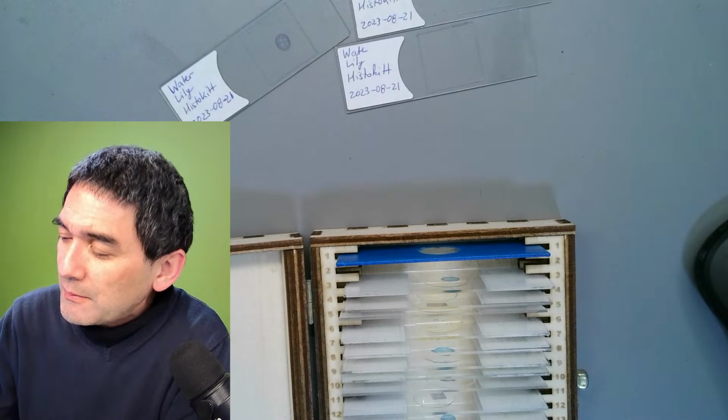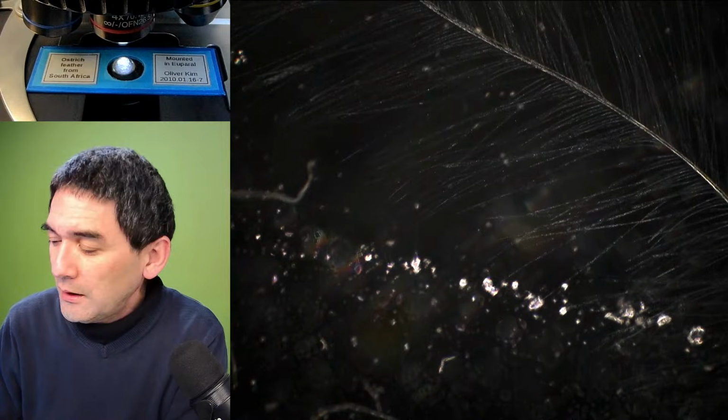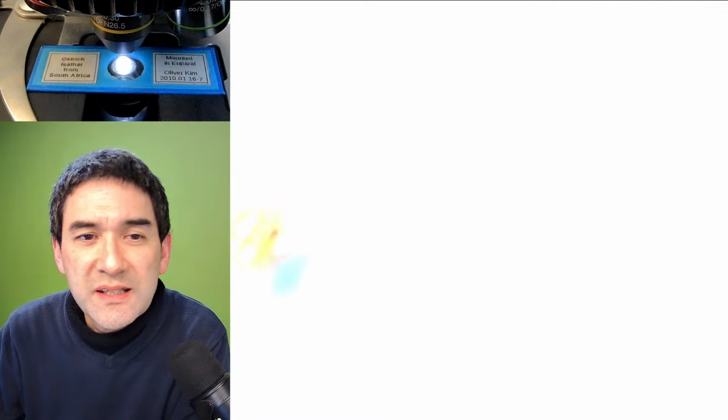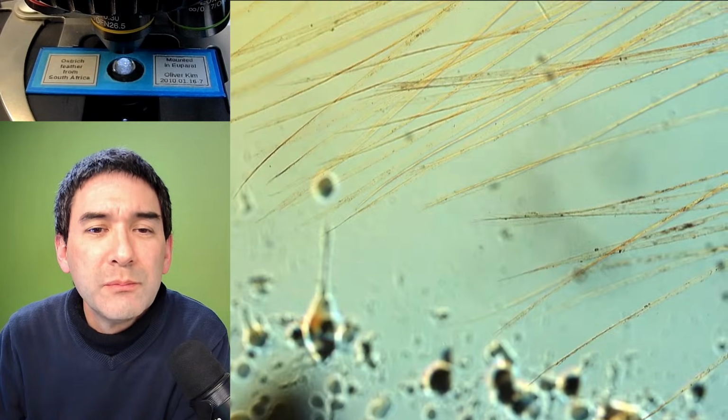Because I also like to check every now and then to see how well they have actually stood the test of time. I always want to know whether they're still sufficiently stable. We see already there's some bubbles here.